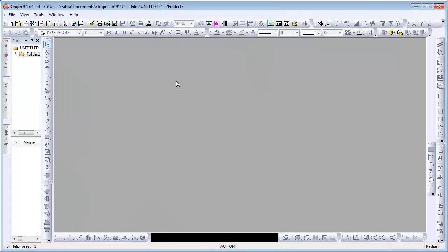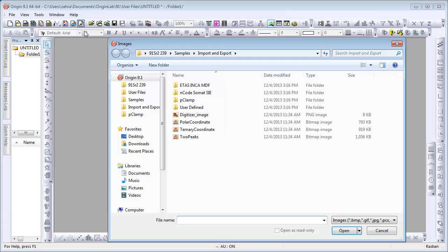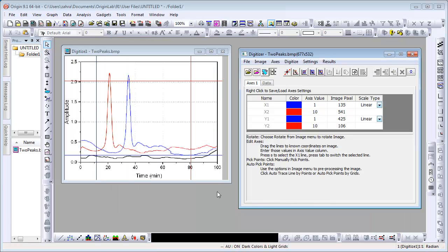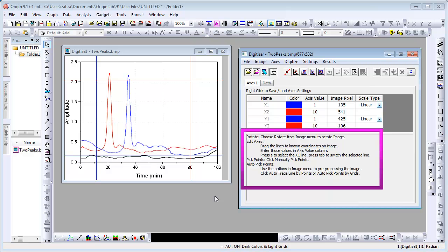Click on the Digitize Image button and open up the Two Peaks image. There are three curves: a red and blue spectra and a black baseline. There are also hints in the Axis tab of the Digitizer dialog.